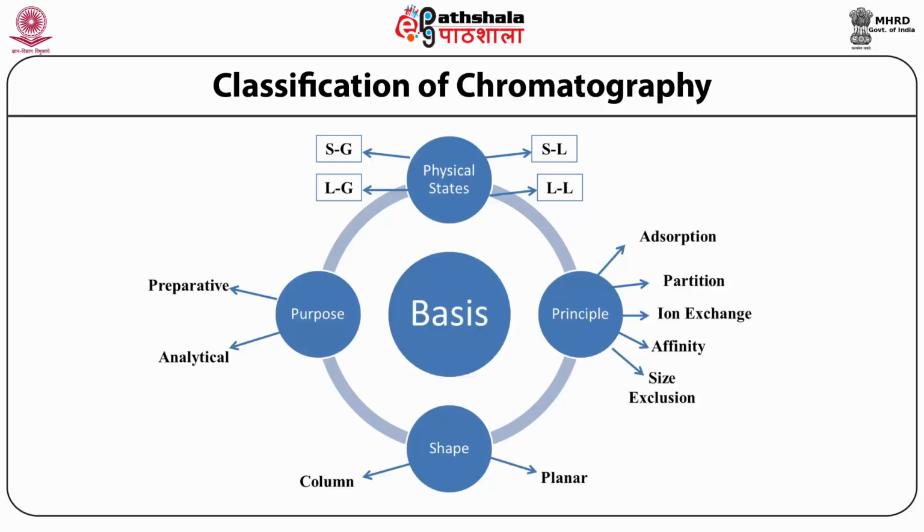Analytical chromatography. This type of chromatography seeks to measure the relative proportions of analytes in a mixture. The sample size applied or injected is very small, and the purpose of this is to identify and analyze the components in the sample and to quantify their individual concentrations in the sample.